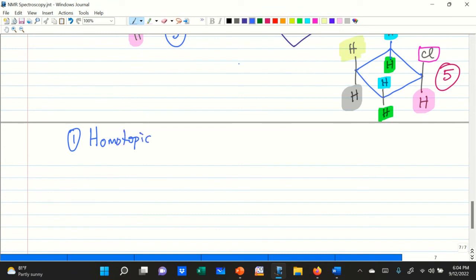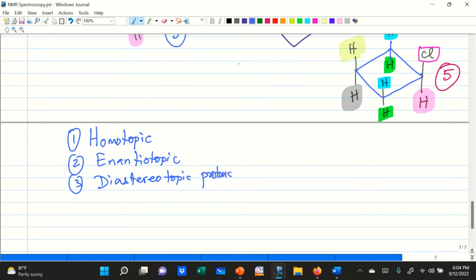Homotopic, this you will understand. If you do not, come to me whenever you can during my office hour or ask the TA. Homotopic, enantiotopic, and another is diastereotopic. These are all referring to hydrogens or protons.